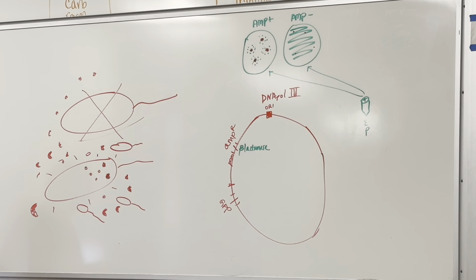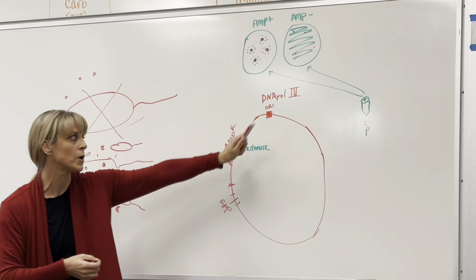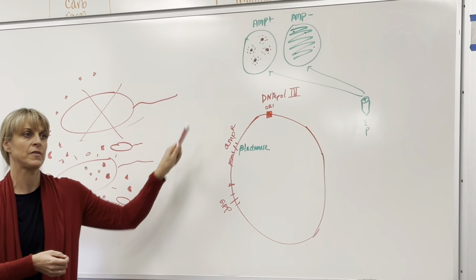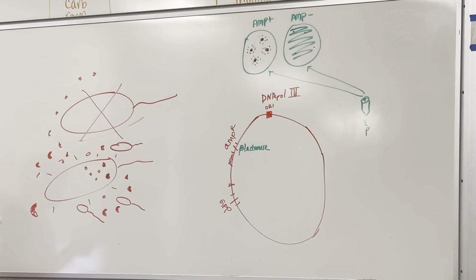I thought the gene we're inserting made it glow. No, that's the GFP gene. Those were already there. The GFP was already there. The ampicillin resistance was already there. It already comes with the ORI. It already comes with the promoters. It comes with the restriction sites. That's how they built it. So we were just checking to see if we could get them into the bacteria. It was just trial and error to see if we could do it.